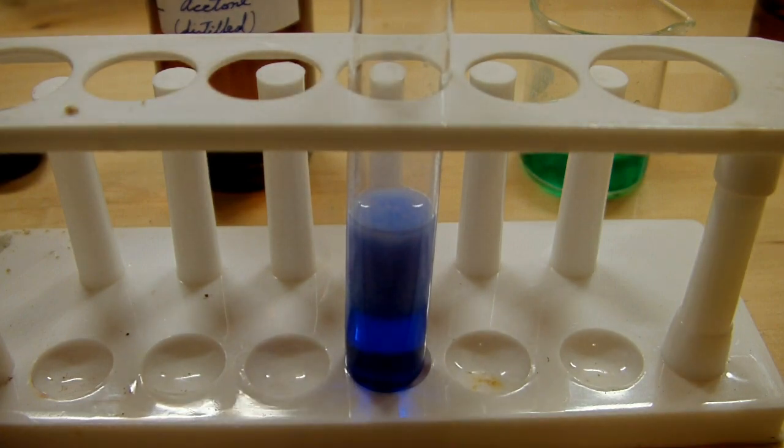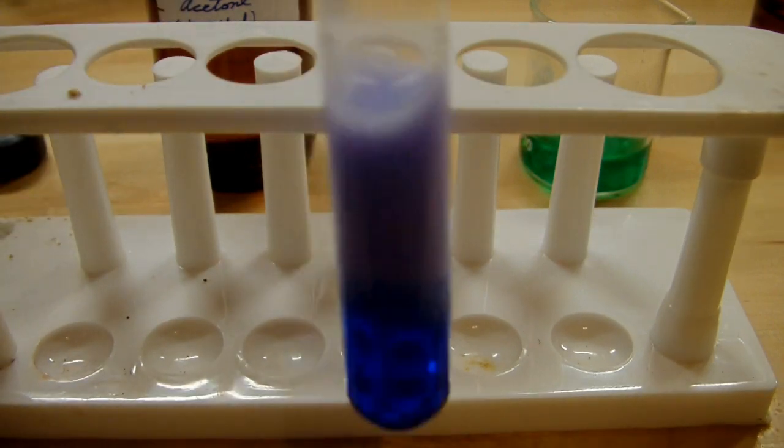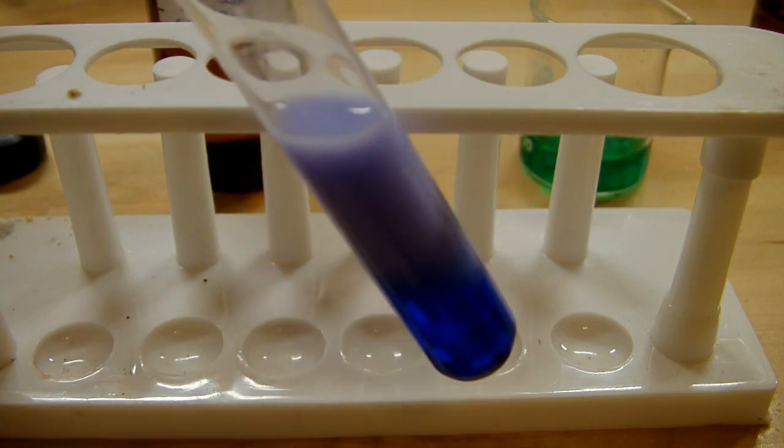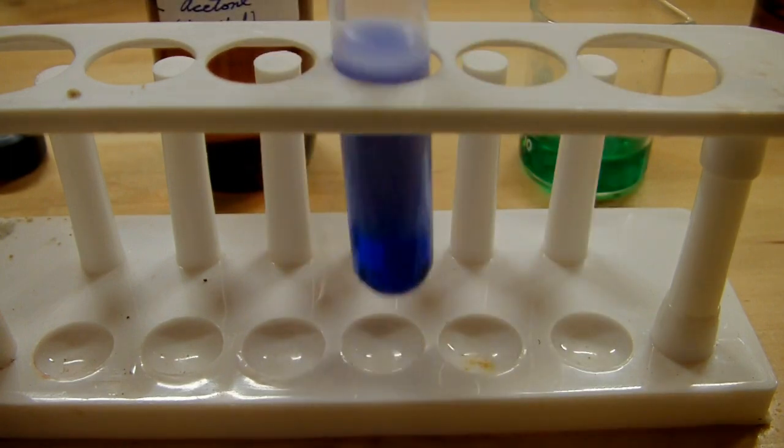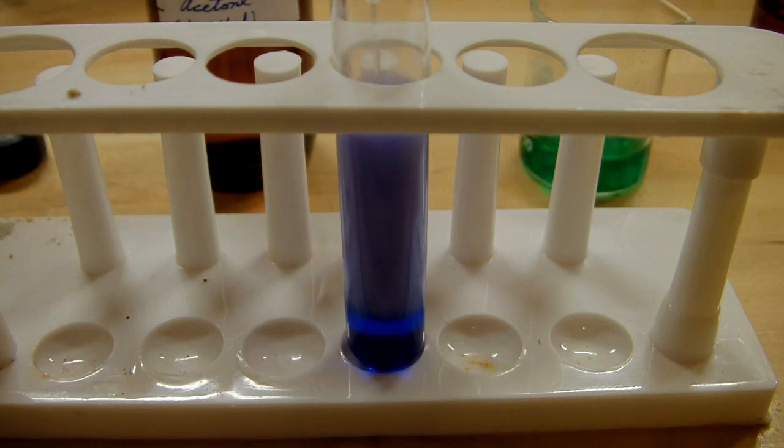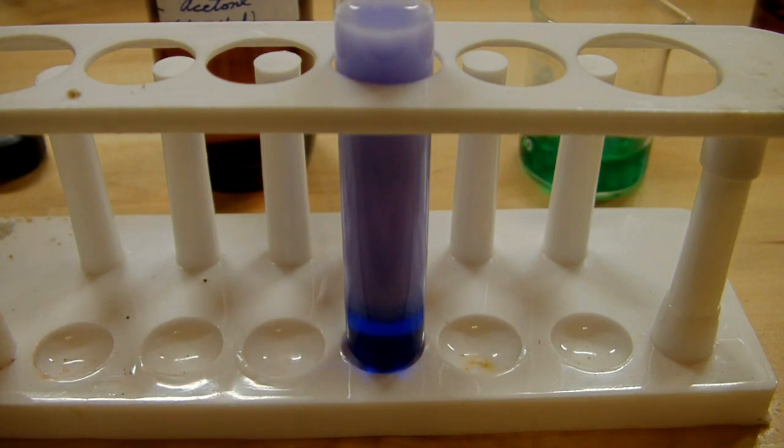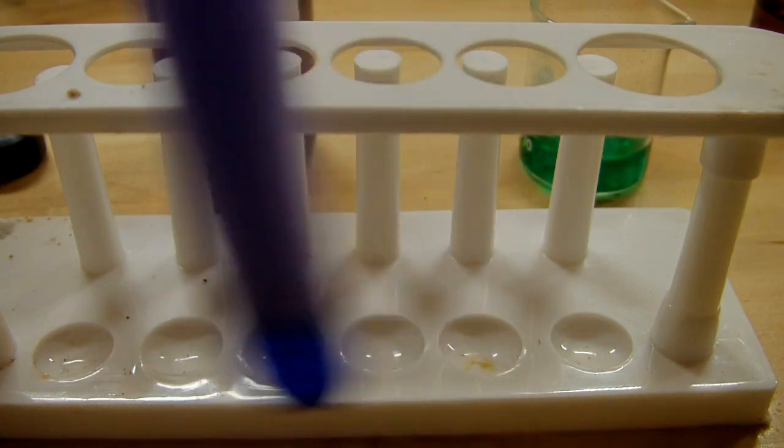So if we keep adding acetone, it's going to push all of this complex out of solution. And we should end up with a nearly colorless solution and a nice lavender precipitate. Now you can start to see the purpley color of it. I'll keep adding a good amount of acetone, quite a bit more than the solution I started with, to push everything out of solution. This is another reason that I chilled everything beforehand, to further reduce the solubility of this compound and get as much as possible out of solution.